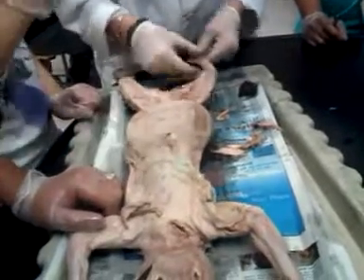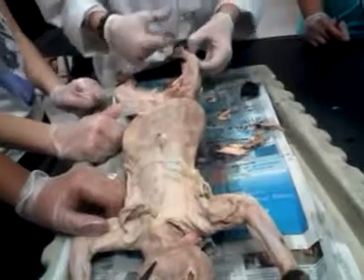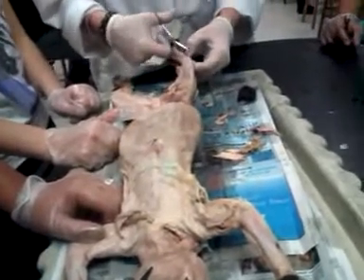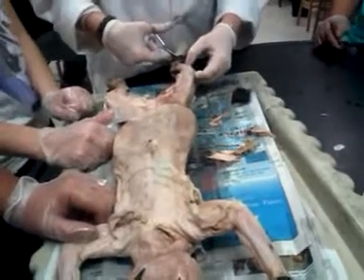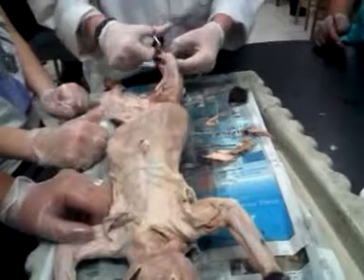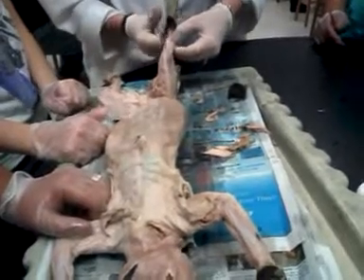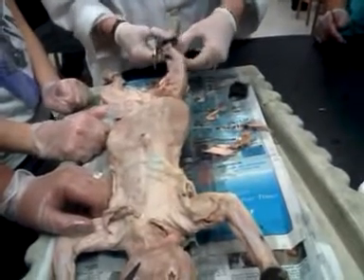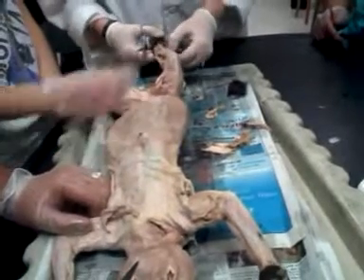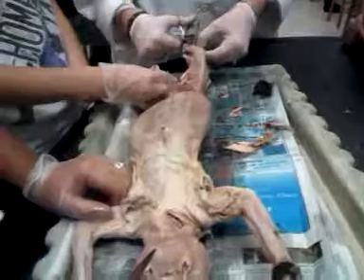Well, so I'll let you get that. Guess what this one is? The anterior tibialis. Alright, there it is. I'm just going to get it off. So we do want to cut them. Not really the muscles, I'm cutting the connective tissue. You see that? And I'm just peeling them off. I just exposed my anterior tibialis.